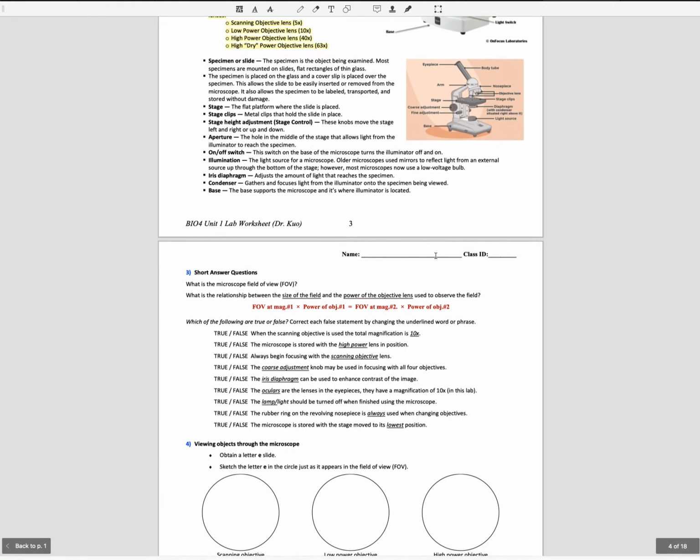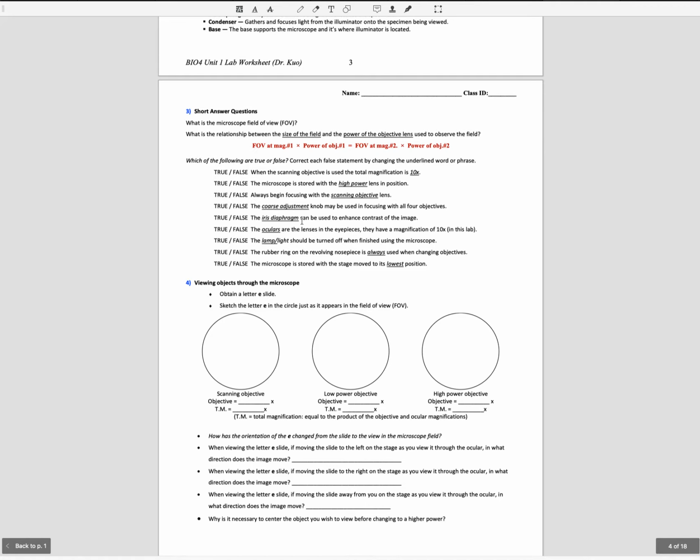The image you are looking at is actually going to be more than 10 times larger than in real life. And that's because what you're looking through are essentially more than one set of lenses. There's a series of 2 sets of lenses, the ocular and the objective.